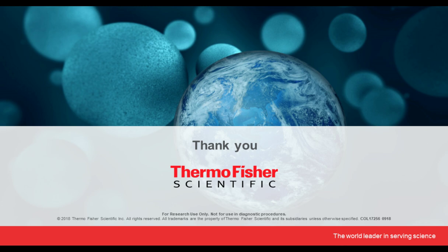Yes. The cell lysate is pretty much straightforward cell lysis. With the tissue samples, you can still use the same lysis buffer, but you have to perform rinsing of the tissue and then homogenization, followed by lysis using the same IP lysis buffer, and it works with that method. Great. How does this protein-level immunoenrichment method compare to the peptide-level enrichment?